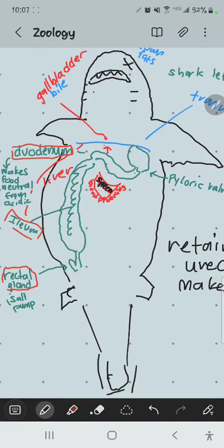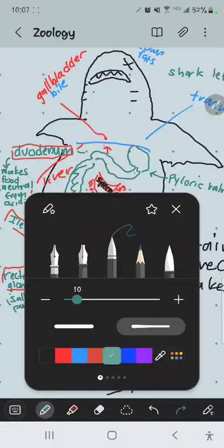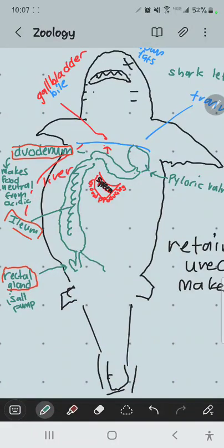But the spleen is a circulatory organ for making blood. That's why most vertebrates have nucleated blood, because the spleen makes blood with nuclei. And in fact, fetal blood in humans is made by the spleen. But when you're born, that stops. Okay, and then the other organ that I want you to see here, I'll do this in a little different color, is the pancreas.